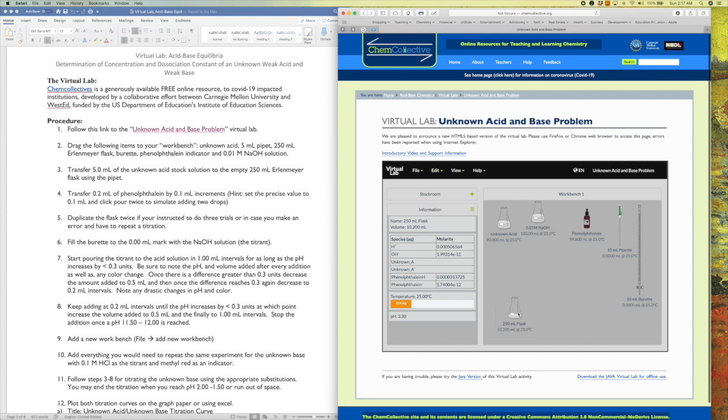So in any case, normally we would use 3 trials to do titrations and take the average at the end. We probably won't do 3 trials for this lab. In a simulated area like this, you're using the same numbers all the time, so there is no reason to use 3 trials.